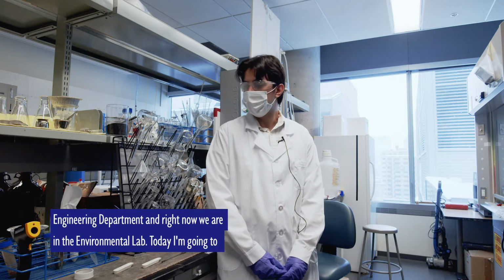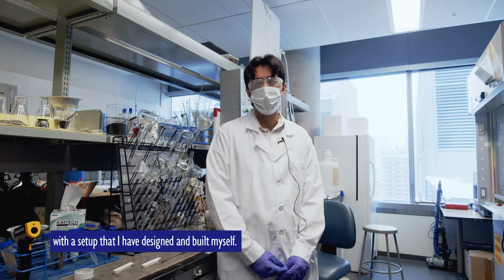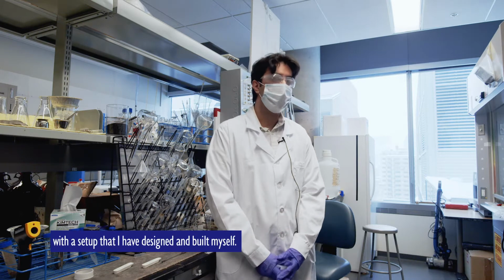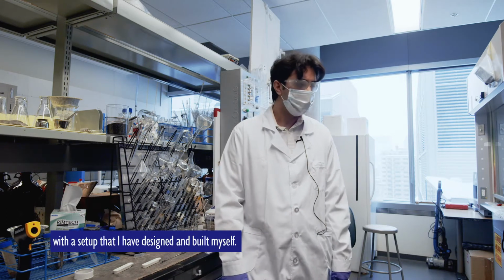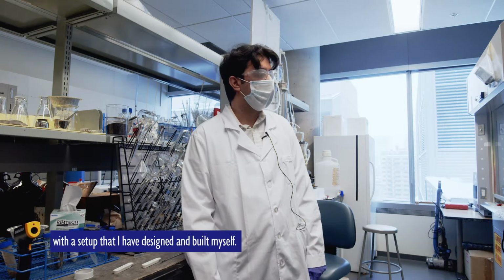Today I'm just going to do some experiment related to my project, that is conversion of the waste, such as plastics, to biofuels with the setup that I have designed and built myself. It's a pyrolysis system.